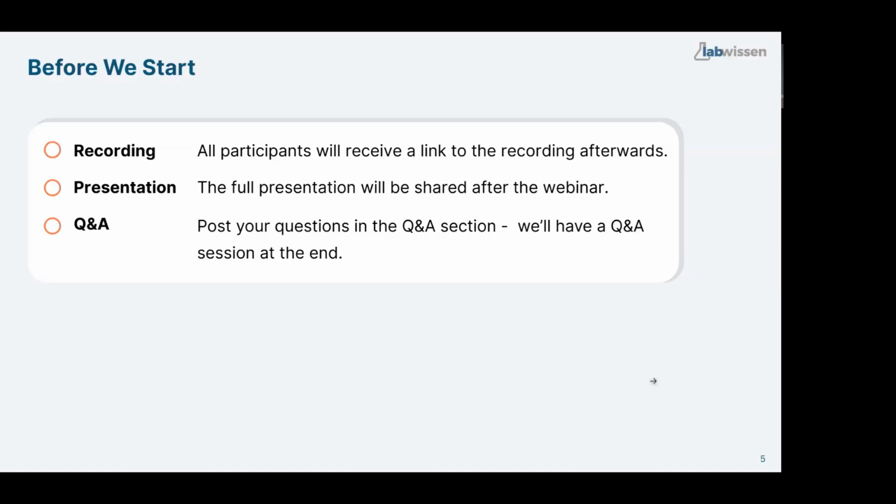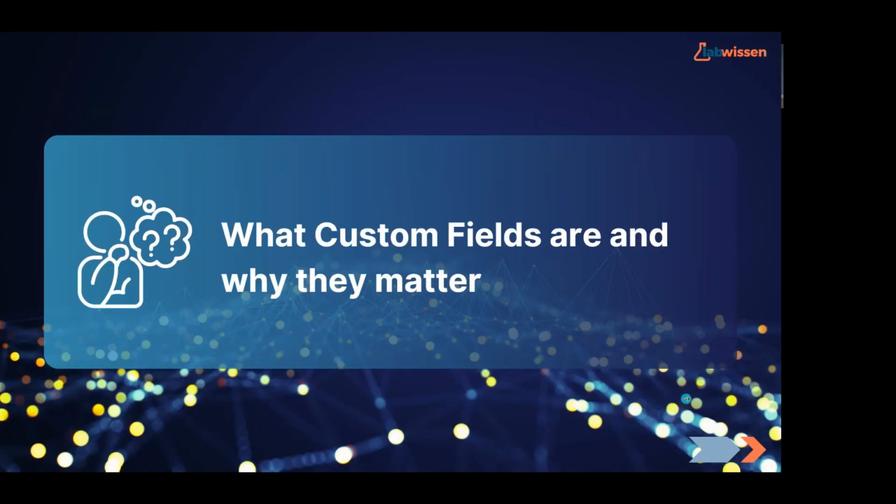So then let's move on with our first chapter, what custom fields are and why they matter. So just a short introduction. What are we going to talk about today?